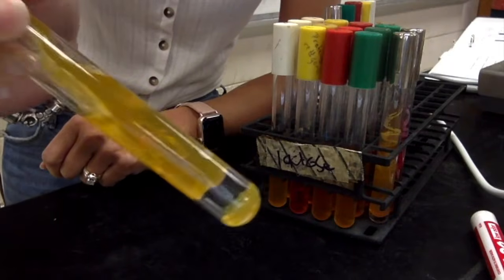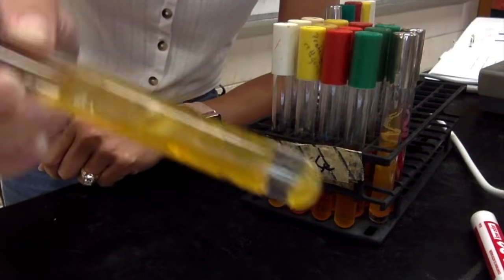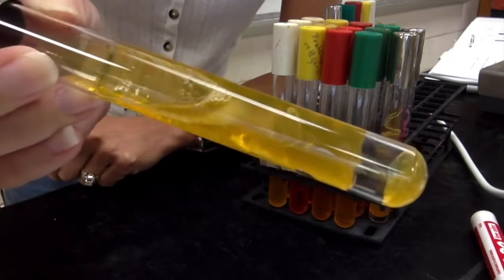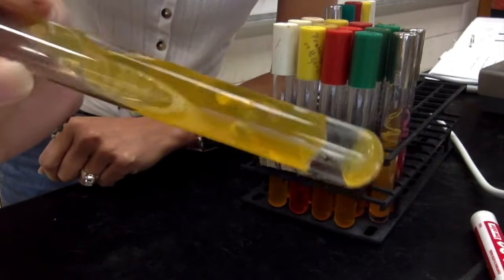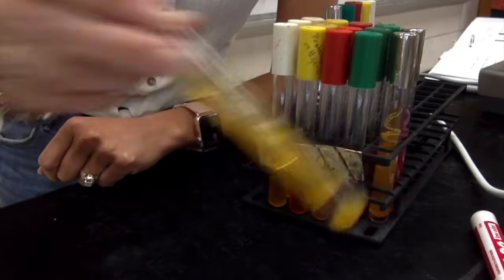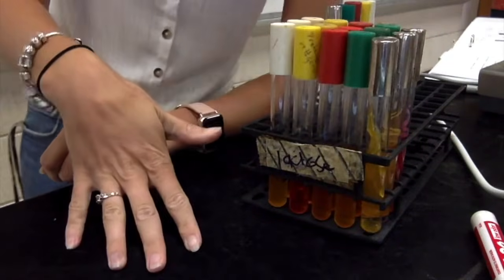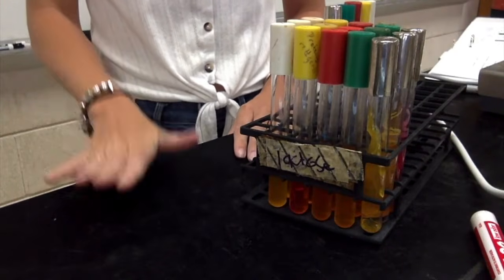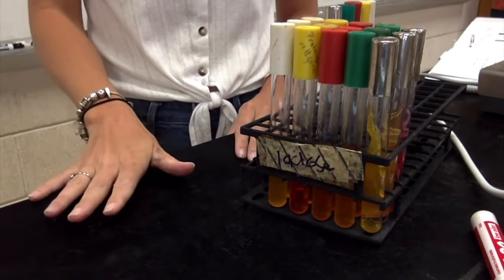And the last part is the H2S production. Do we see any black in the tube? There is not any black in that tube at all. So it would be negative for H2S. If you were recording this, you would record A over A with gas, no H2S. That's how you would record it for E. coli.